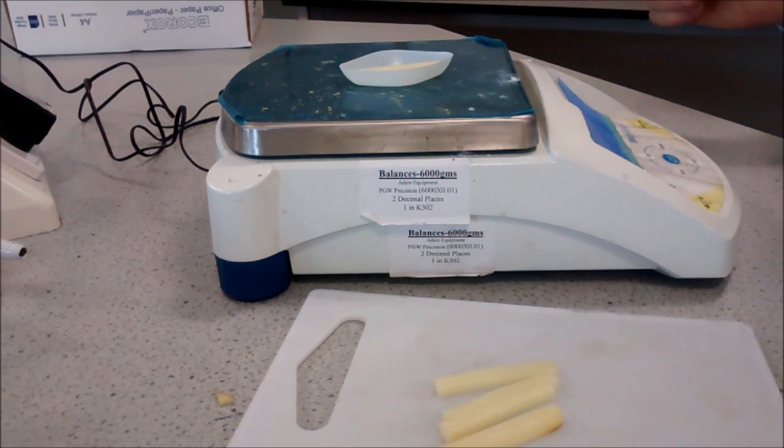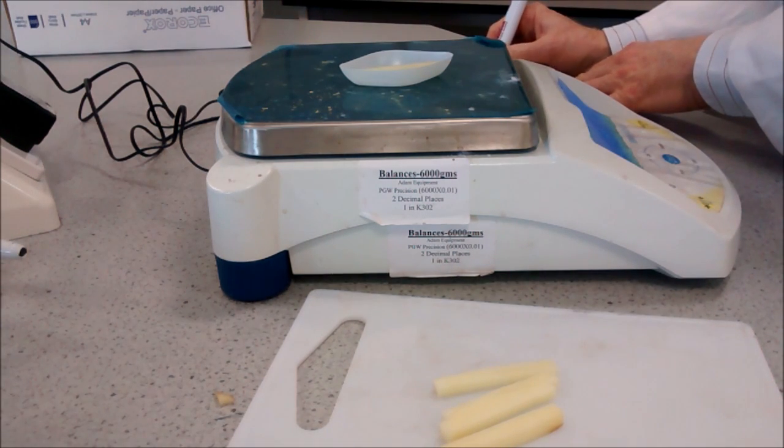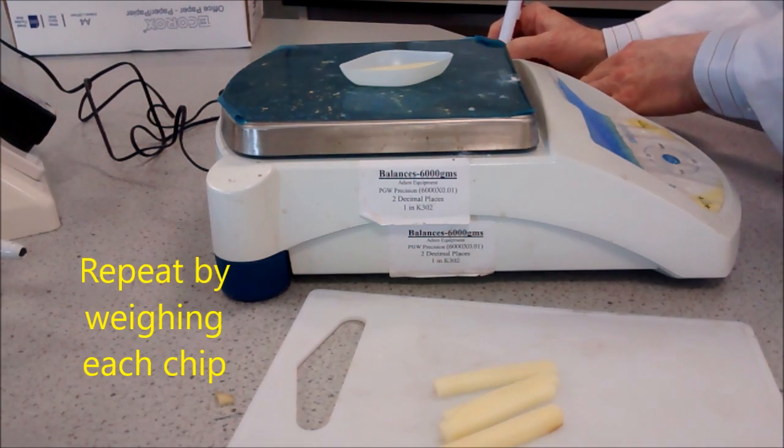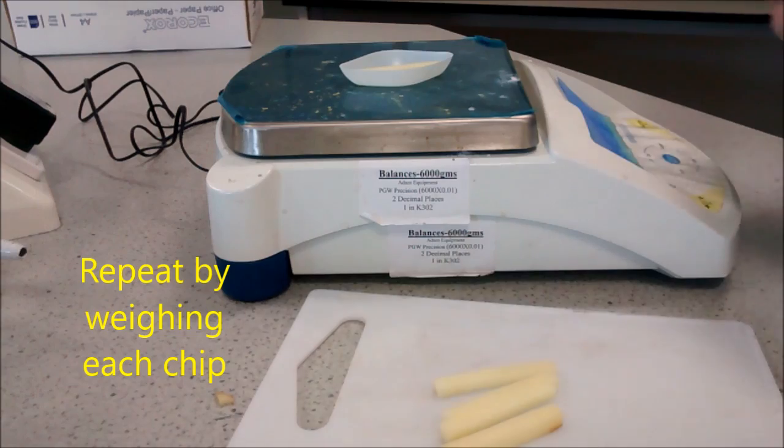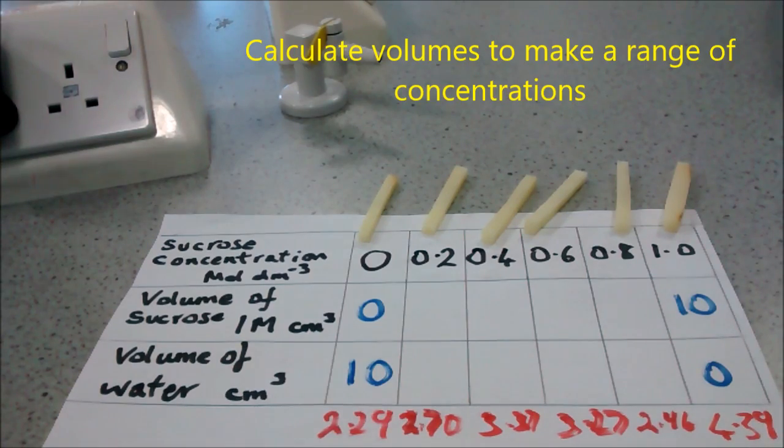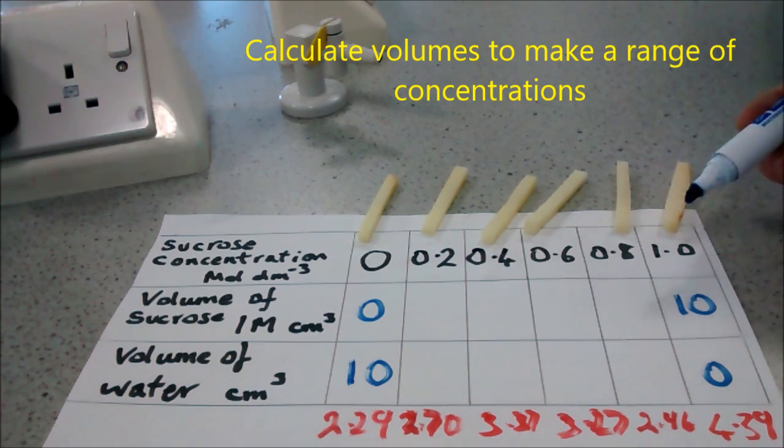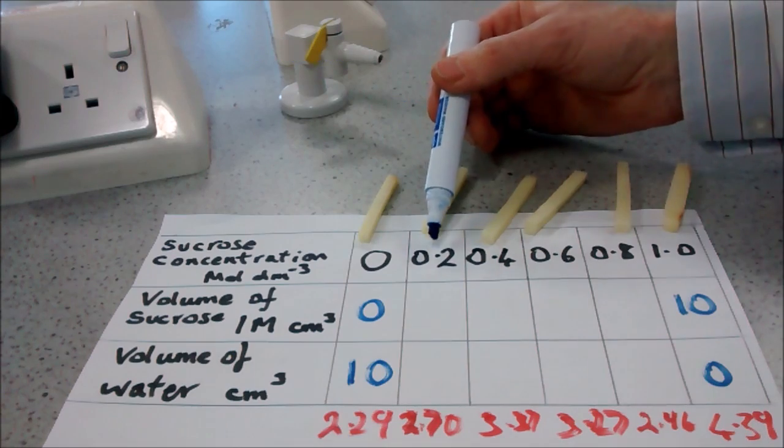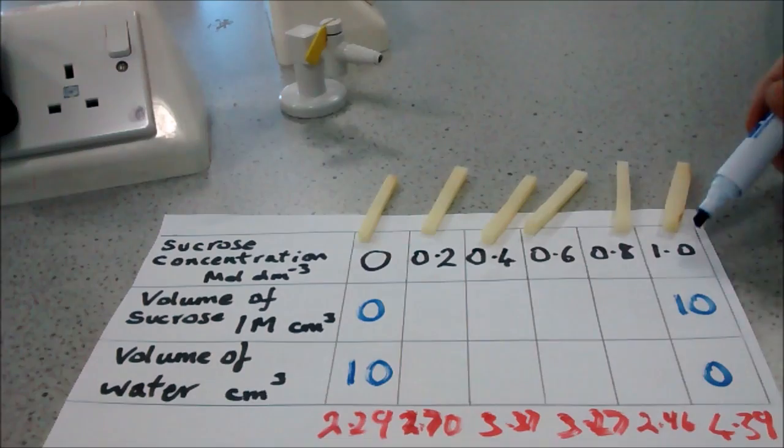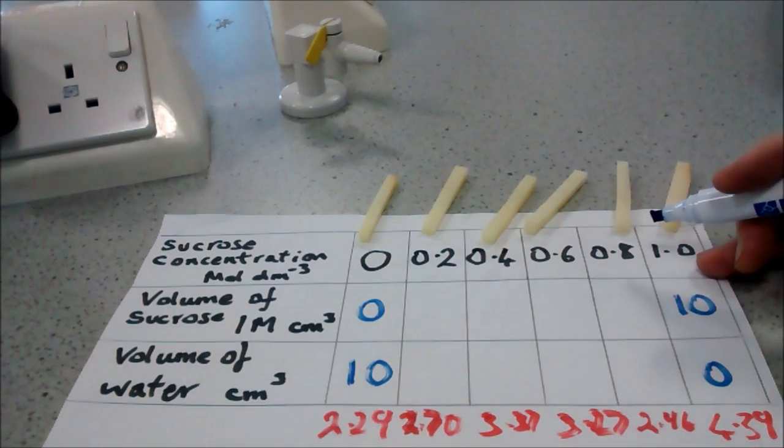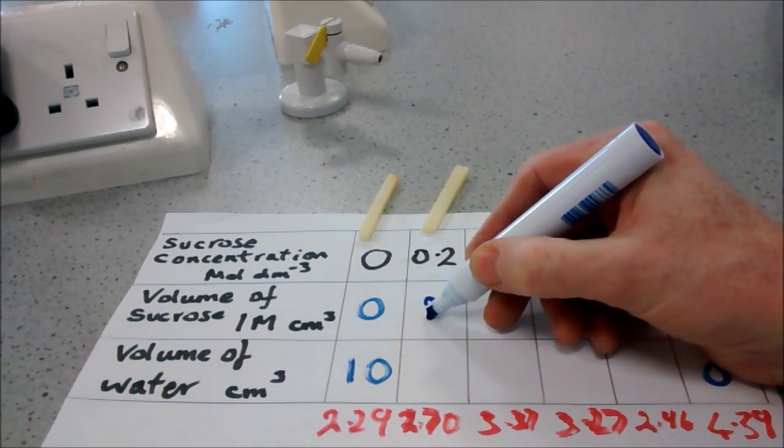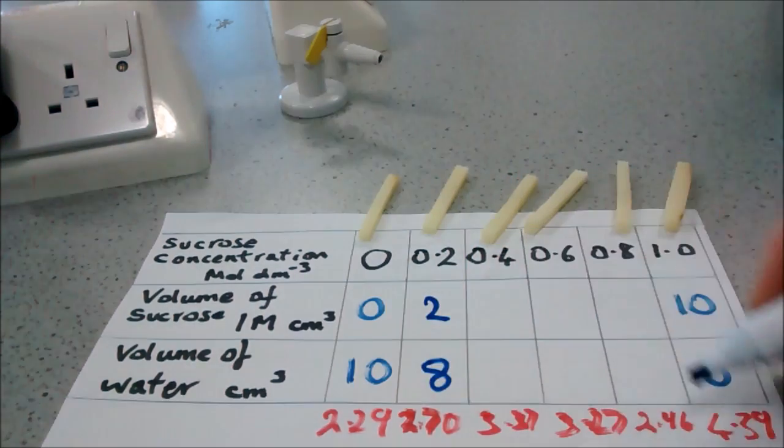2.7 grams. Okay, so we need to make sure we've got a range of concentrations. We need concentrations from 0.2 up to one molar. We've got a solution of one molar sucrose. To make 0.2 molar, we need two milliliters of the sucrose with eight milliliters of distilled water.